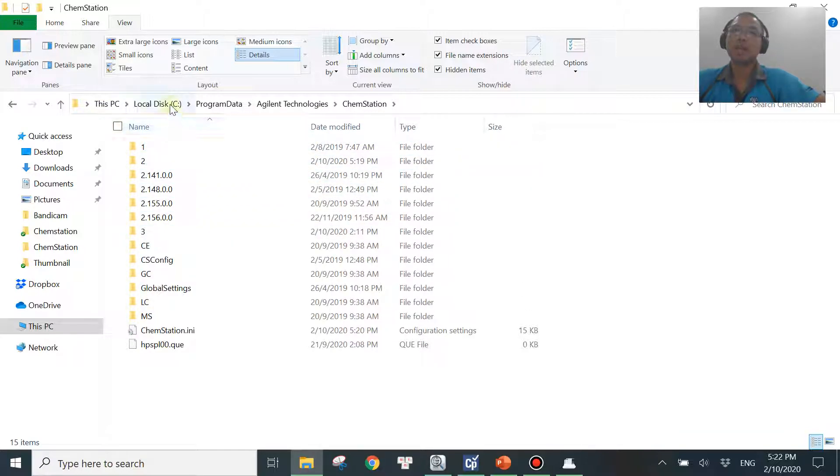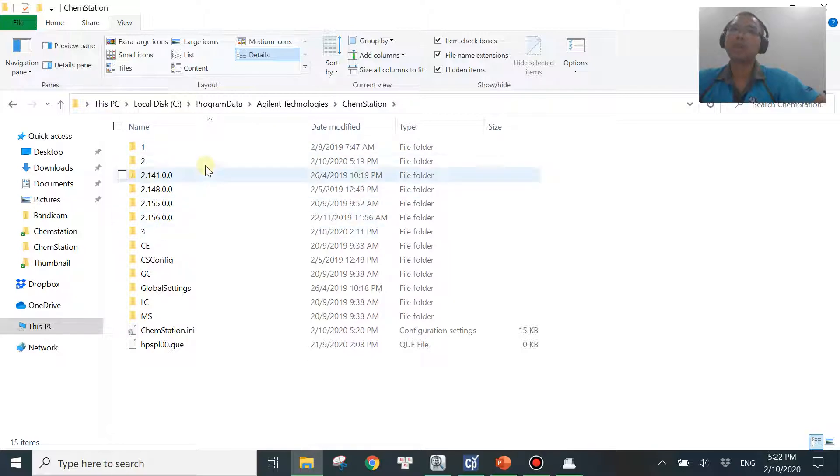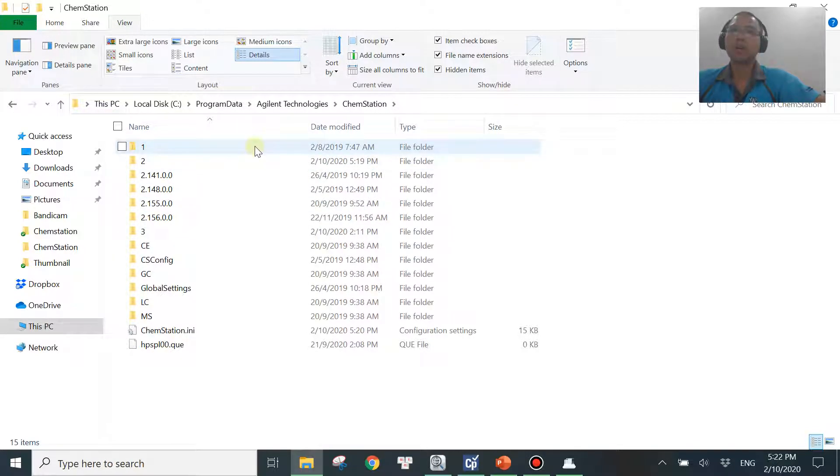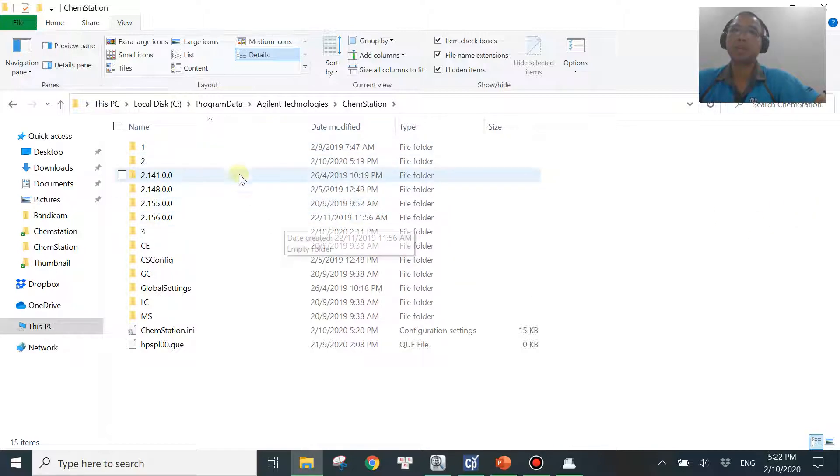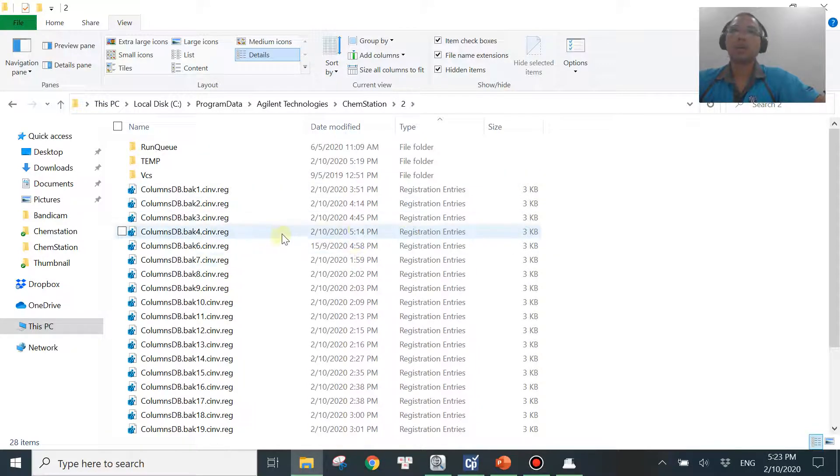It's just the same that if you are using the old version, it will be C, Chem32 over here, then you will see one, two, three, right? So which instrument you just tried to launch just now, then you just want to go into that instrument. In my case, it was instrument number two. Then we go into that.